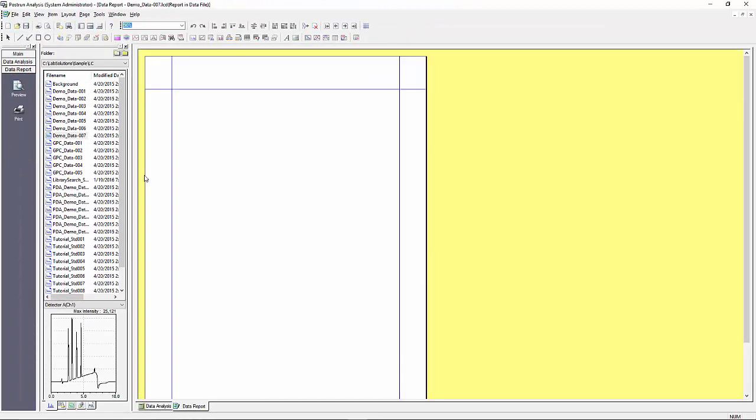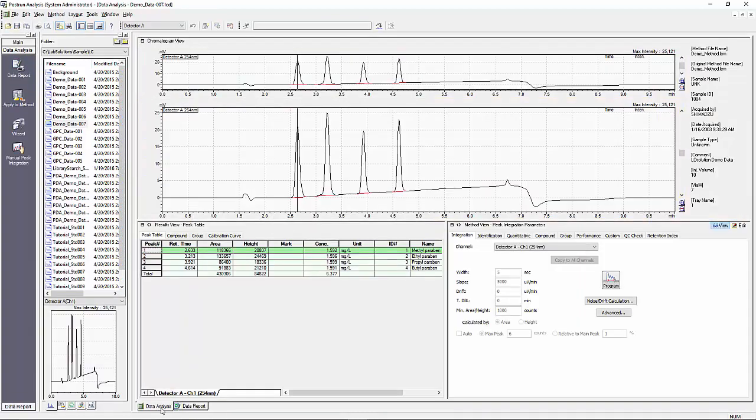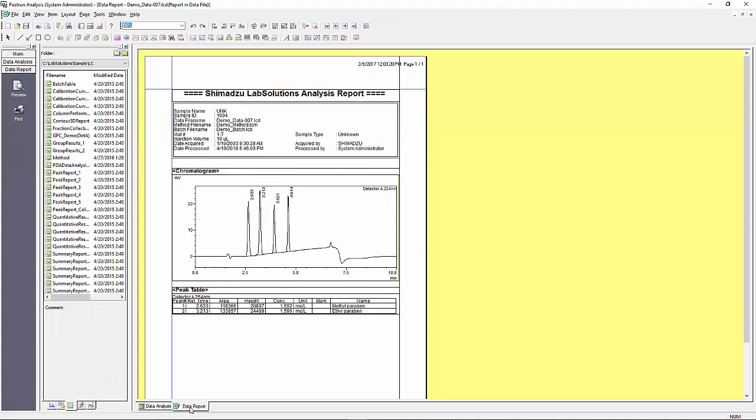The data report icon opens up with a default data report template that Shimadzu has created for you. Please note that at the bottom the data analysis window is still open as indicated by the tab. Each data file has its own individual report format that is unique to it. When you save the data file with changes made to the report format, the report is saved as part of the data file.